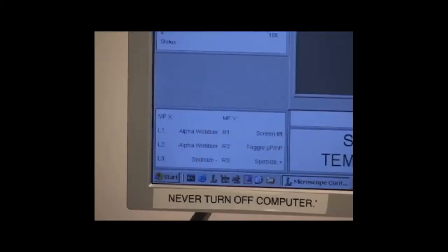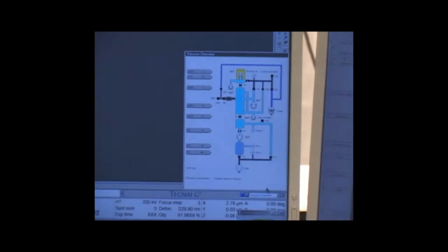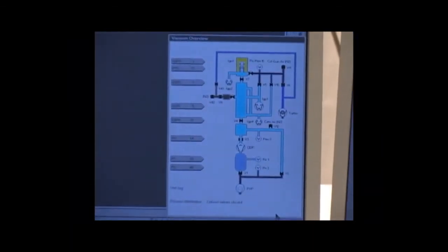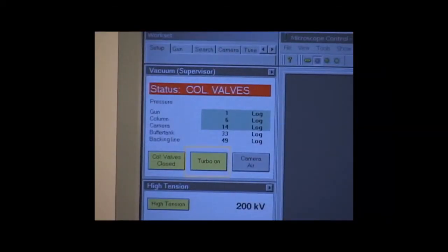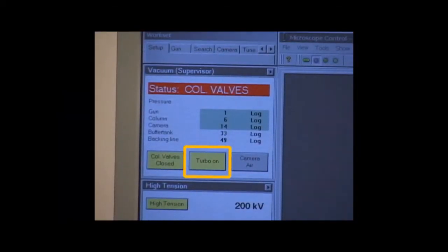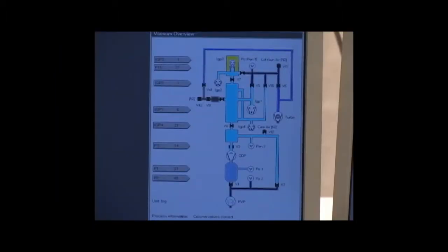The lower left box with L1, L2, L3 reflect the left control panel, and the R1, R2, and R3 shows the state of the right control panel. The multifunction controls are used for several functions in different modes. In the right bottom box, select Vacuum Overview to show the status of the vacuum system and valves. Now, the Turbo On button is yellow, indicating the turbo pump has reached its full function, and the TEM is ready to receive the sample.